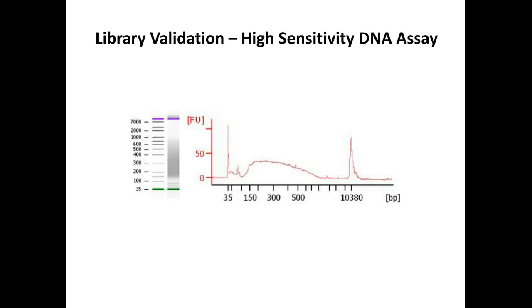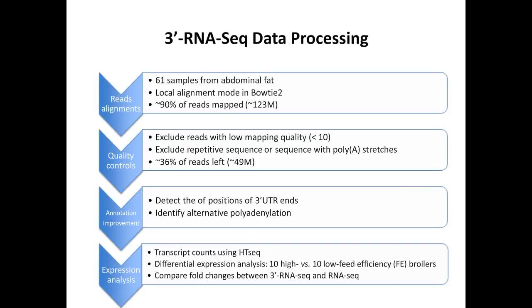If you use a typical DNA assay, it would not be detected, so you should use a high sensitivity DNA assay. We checked all the cDNA libraries that we generated to make sure that they have high quality. When you do this DNA assay, you see a product, which indicates that there is enough material for sequencing. And then we followed this protocol for data processing.